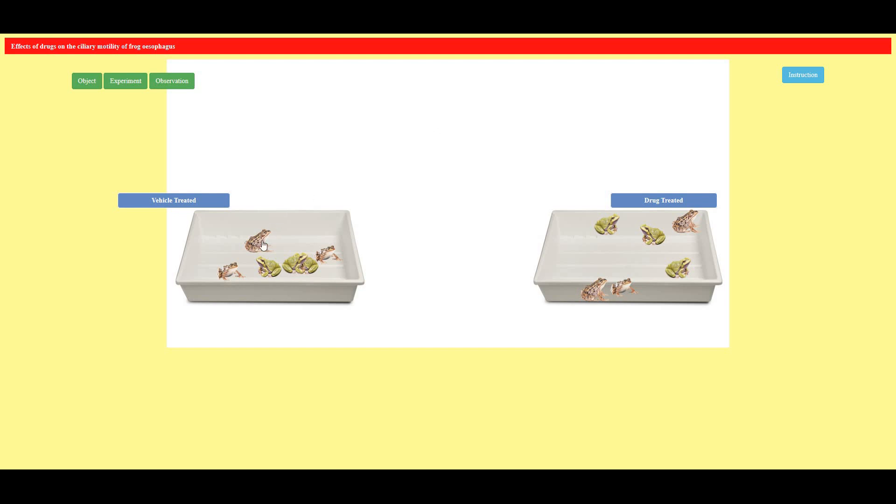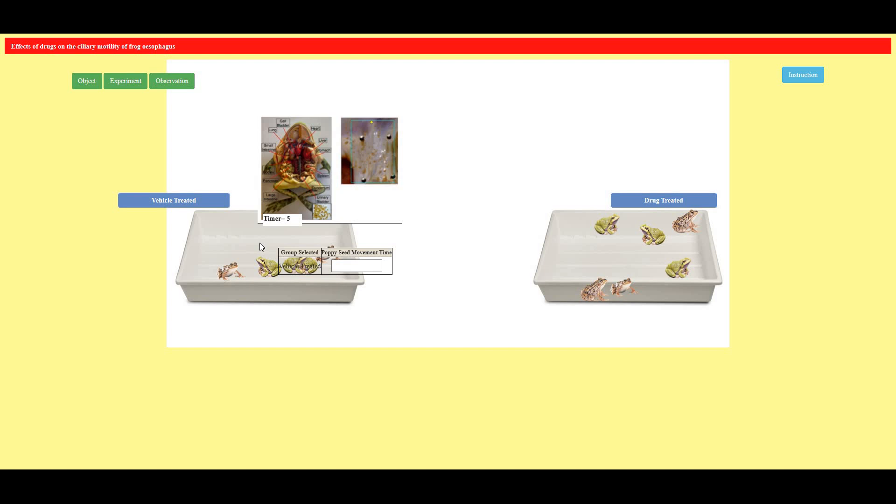First I'm going to select the frog. I have selected this frog and here it is treated with vehicle and now I'm going to see the time. It is 32 seconds. So I'm writing here 32.